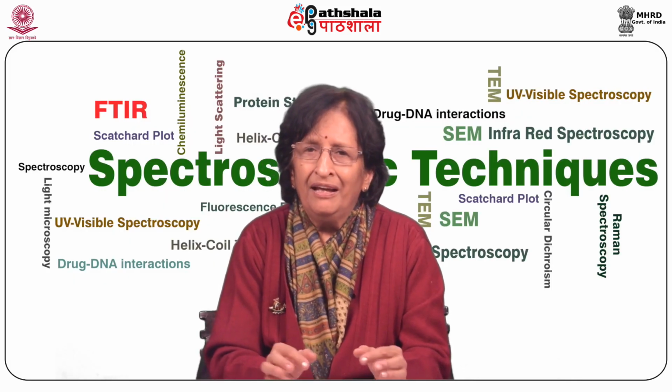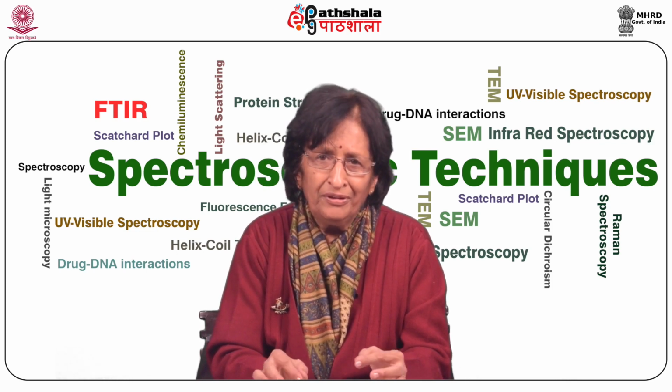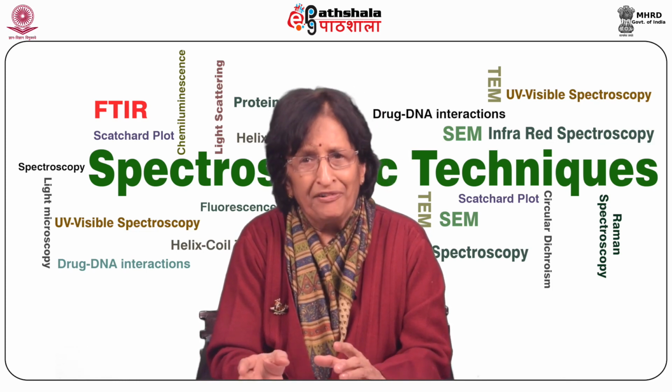Atoms and molecules, as you know, undergo electronic transitions in visible and ultraviolet region.